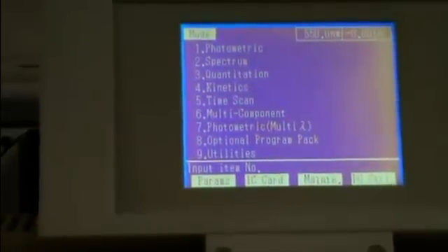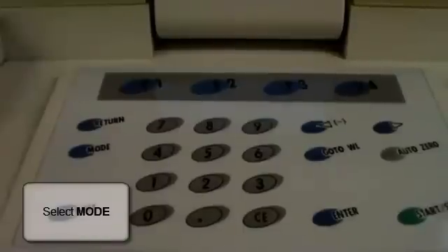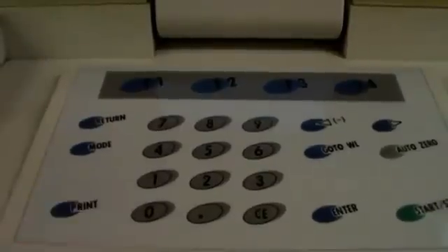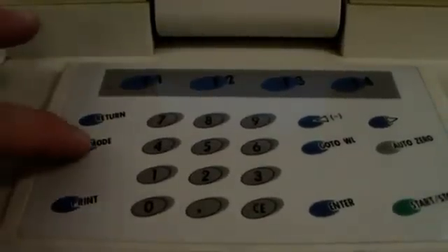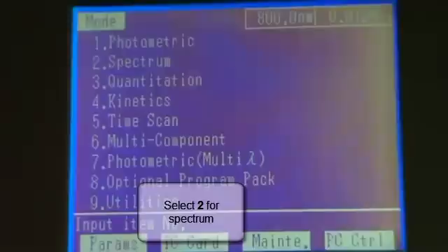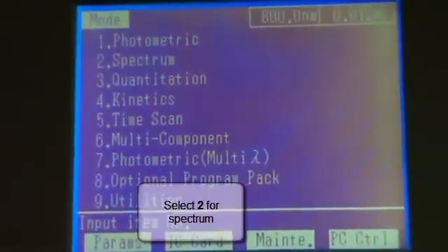First we have the main menu. There are a range of options available and in this experiment we will be selecting the spectrum option. We press mode to obtain this menu if it is not already available and then 2 to select the spectrum option.